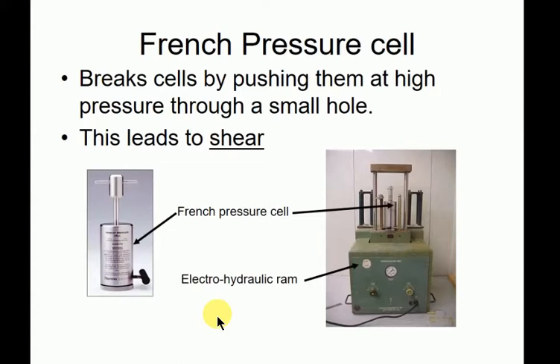What you don't want to do is give this apparatus to someone who doesn't know what they're doing, because then they'll misalign it, and it'll come down, and it'll buckle. You know, it operates at thousands of pounds of force. So you have to align this really nicely. You have to treat it with respect. And the cells come out the bottom, and then you'll get really good efficiency of lysis.